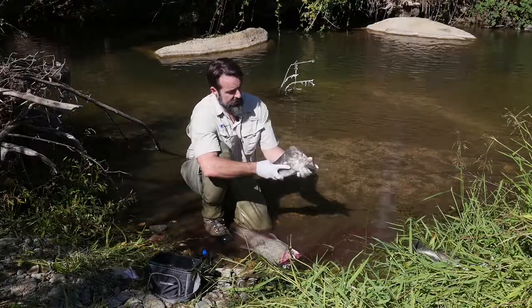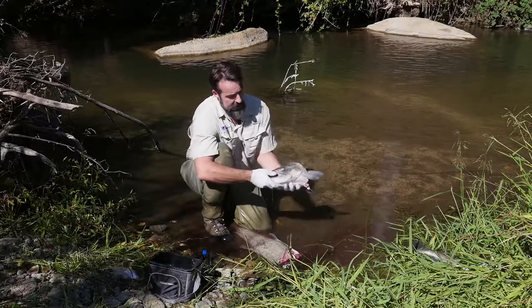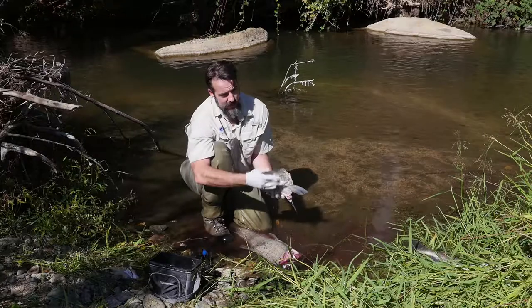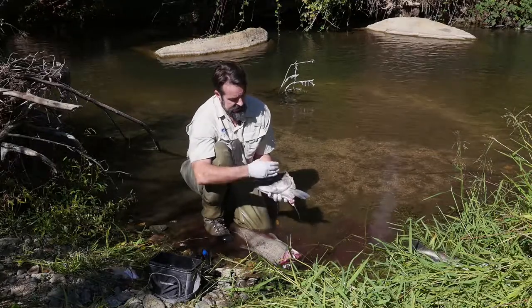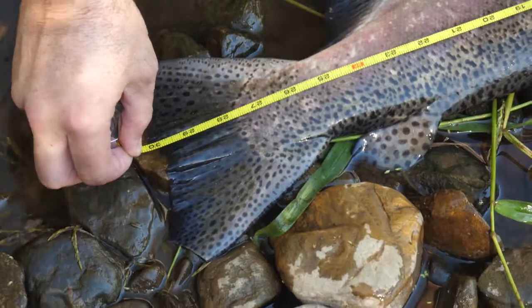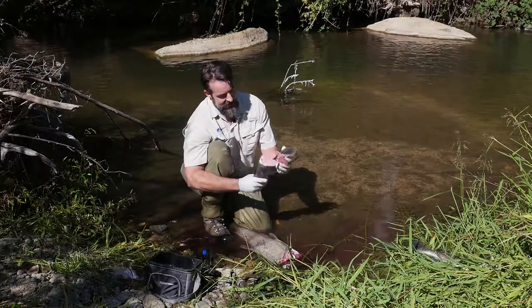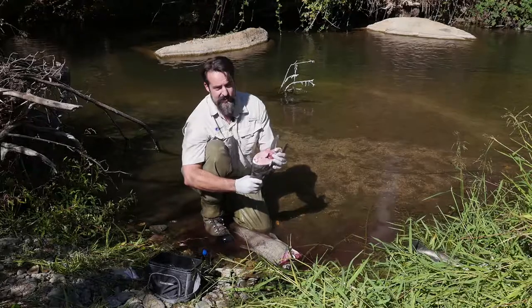There's a coded wire tag in there somewhere but we don't know exactly where, so we're going to take the whole head. We put a head tag — which is a little piece of paper that says the date and where we collected it, the sex of the fish, the length of the fish — put that in a plastic bag, and then you get to carry this heavy thing all the way off the stream and take it back to the appropriate folks at Cal Fish and Wildlife.